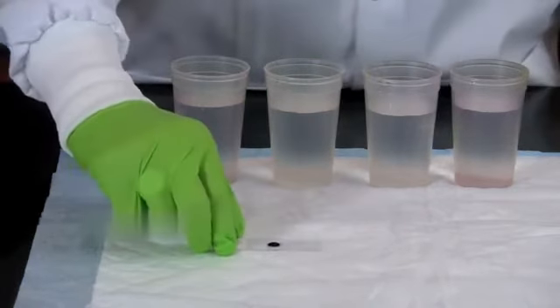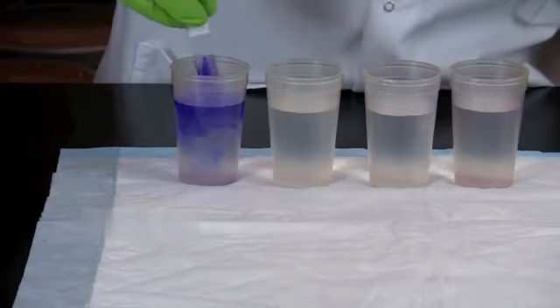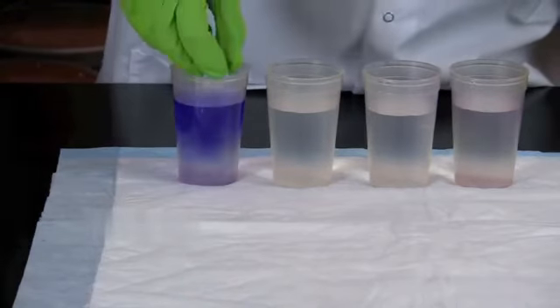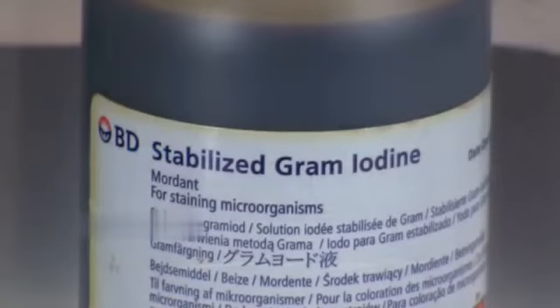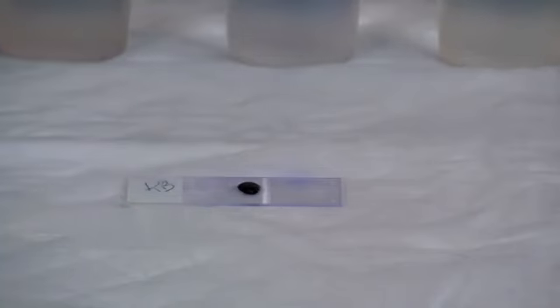Rinse the slide by dipping it in a beaker of water 2 to 3 times until most of the stain has been washed off. Next, add a few drops of gram's iodine to cover the bacteria, and then let this stand for 1 minute.